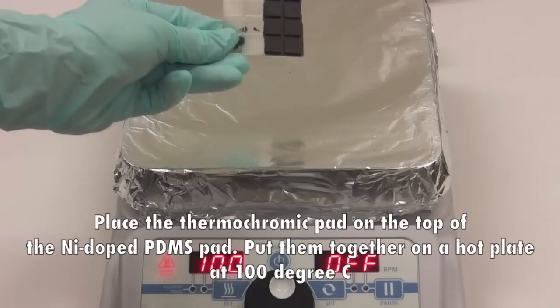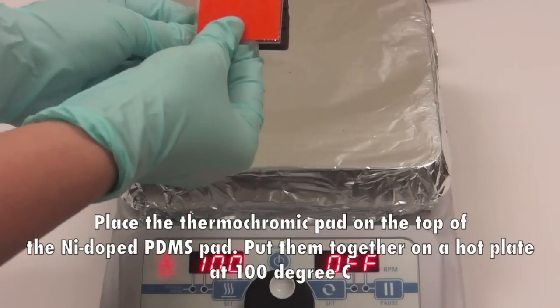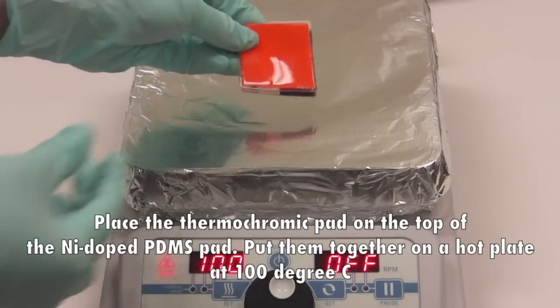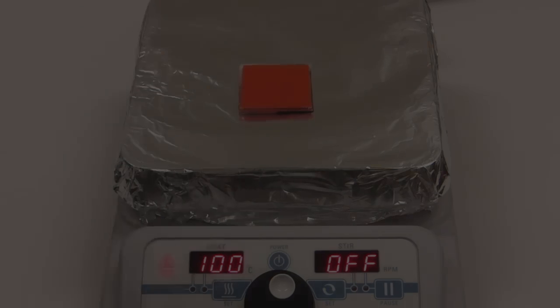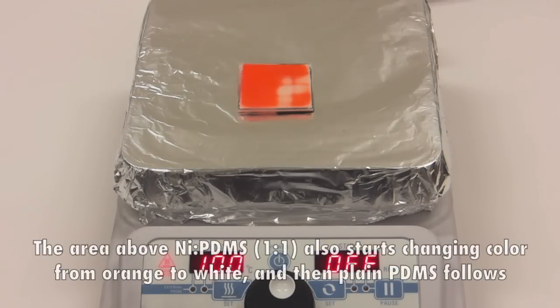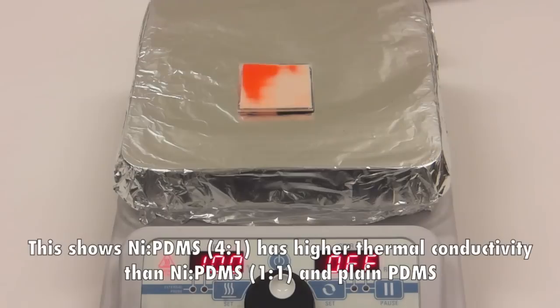Place the thermochromic pad on top of the nickel-doped PDMS pad and put them together on a hot plate at 100 degrees C. The area above PDMS 4-to-1 color starts to change first. The area above nickel PDMS 1-to-1 also starts to change color from orange to white, and then plain PDMS follows.